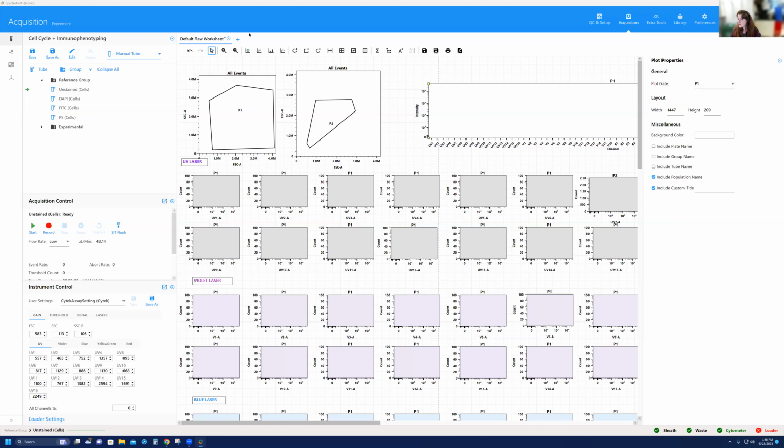Yeah. And I just want to add on to that too. I've been in research for most of my flow cytometry life, and now I'm in the clinical setting for my position. What I would highly suggest is, if you have to look at intensity of signal and look at MFIs to track antigen density or anything like that, you should do some type of validation and stability experiment post staining to make sure that you're getting all the answers that you need.